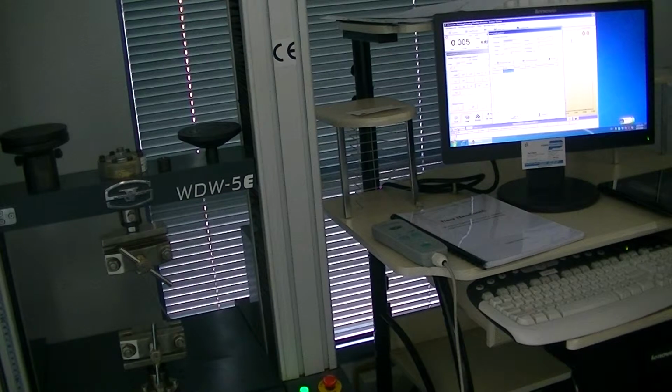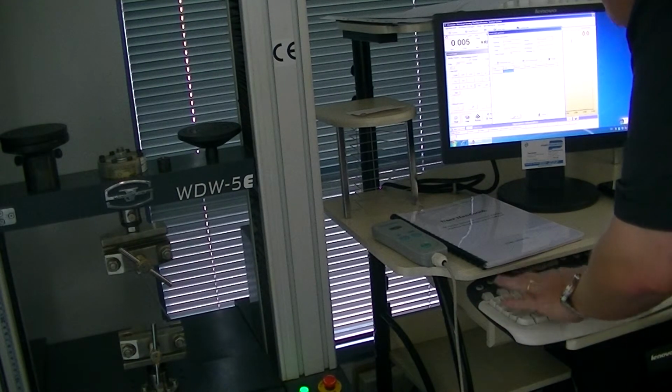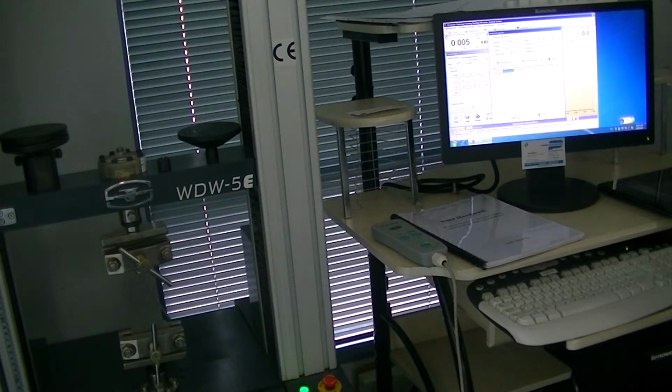Slide 5. Enter specimen information, in this case packing tape. So in here, material, we can type in, in my example I've got packing tape. So we can write it like so. If it's a multiple test, click batch newly built. So we're going to do 2 tests. It can be 1 test, it can be 2 tests, it can be 200 tests, but basically a batch test. So I'm going to click batch newly built, as it says on the slide.